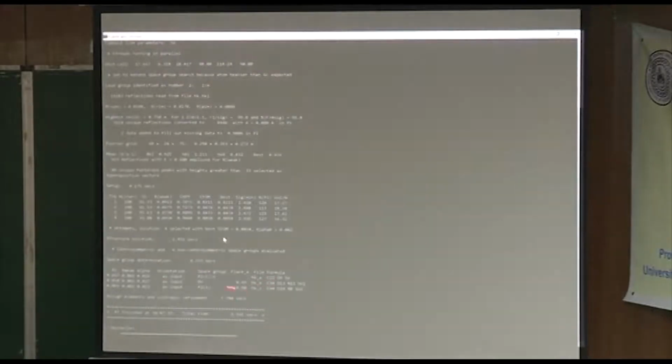So usually I would try the first one. Also, you can look at the expected R value over here. This is not actually the minimum expected R value, but these are all similar. So, you know, it's a possibility that it's not the first one, but it is. So to view it, you can go to XP.